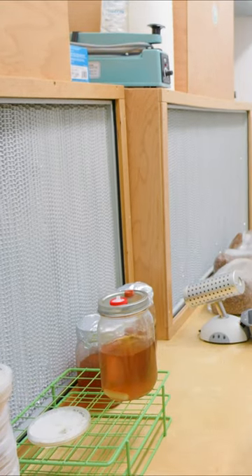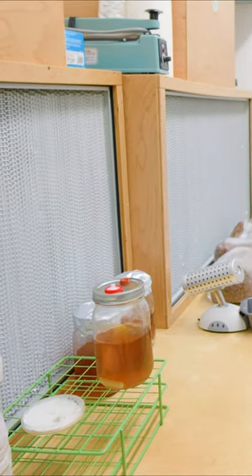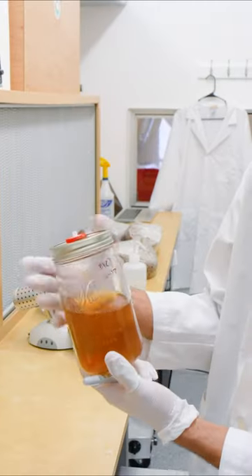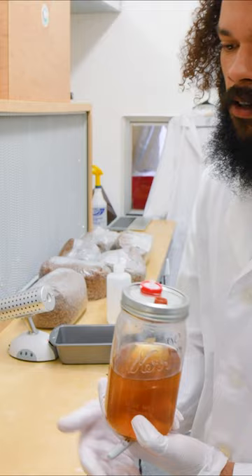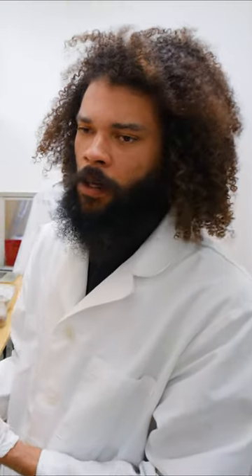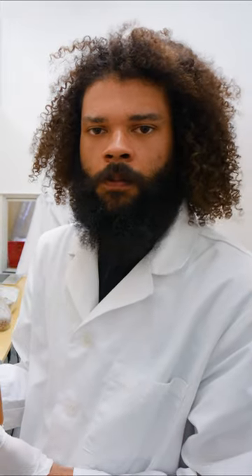Anything to do with making your own cultures or growing out grain spawn is the most important part of your mushroom growing journey. So we'll turn this into 500 milliliters of myceliated liquid culture. And with that, we can inoculate one pound of grain spawn per milliliter.